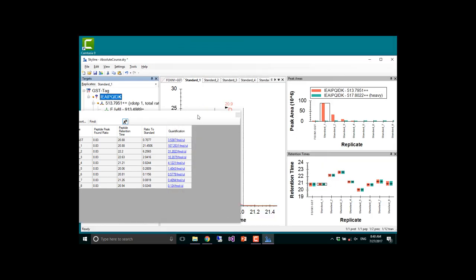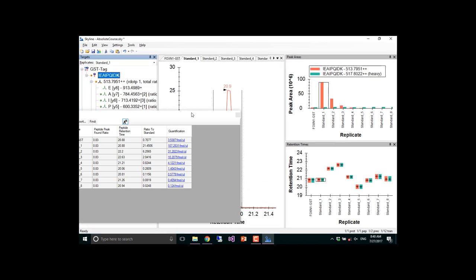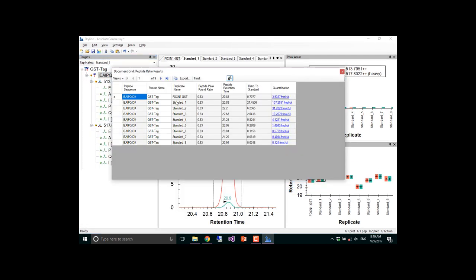You can look on yours, and I'll talk about what I see. So this most intense standard one, what's its ratio supposed to be? What is it actually? 40. So you can see how these get very big. What's the one that's closest to 5? Standard 3 is supposed to be 5. And in fact, it's only 2.